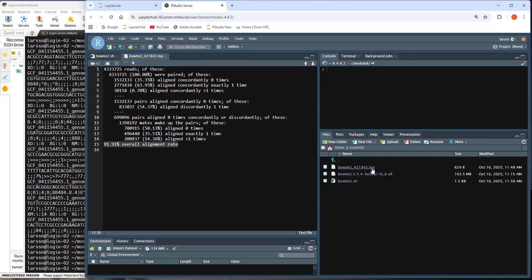So look at the log file from a bowtie remapping to get some idea if something is wrong, because if this is super low, right, then something was wrong here. You have perhaps used the wrong index or the wrong read files. Because bowtie will not crash for that reason, right? It will just make a poor result. Okay, I think that's it for now.